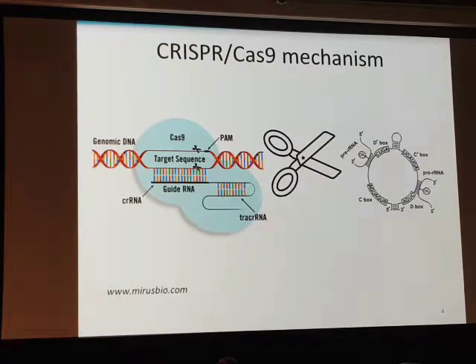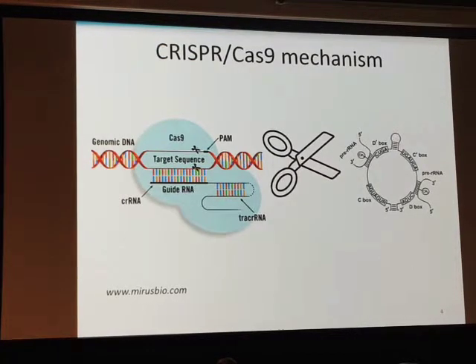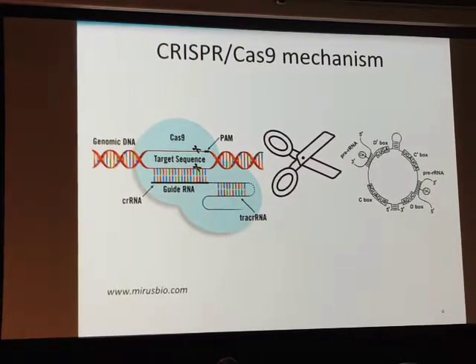Well, I suggest that the CRISPR-Cas knockout mechanism requires no repetitive presentation. What's important in our study is that since the majority of snoRNAs are encoded within the introns of other genes, the use of CRISPR-Cas9 systems allows one to alter the genome sequence of a snoRNA of interest while preserving the exon structure of its host gene.